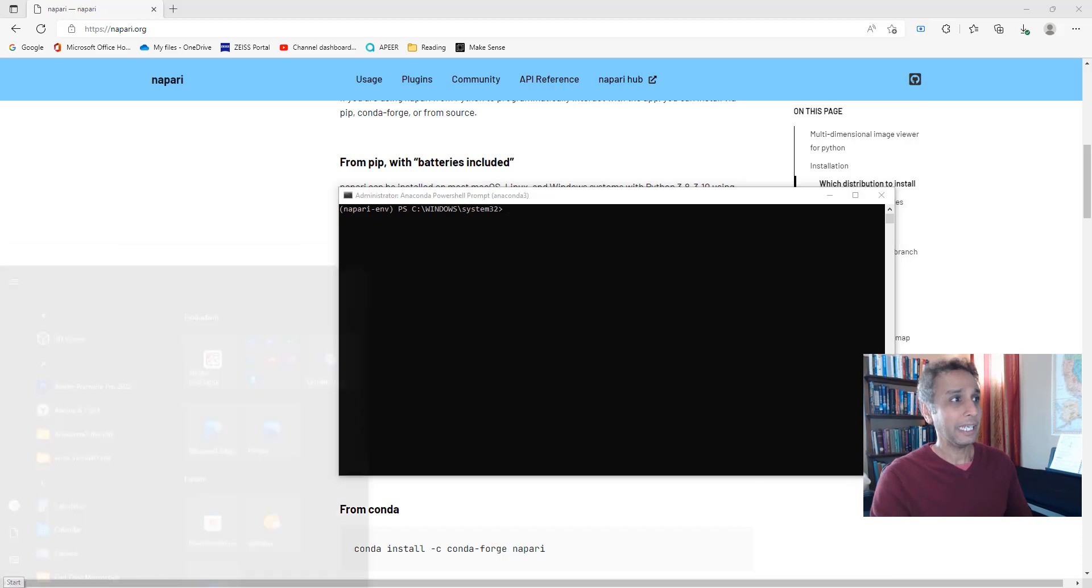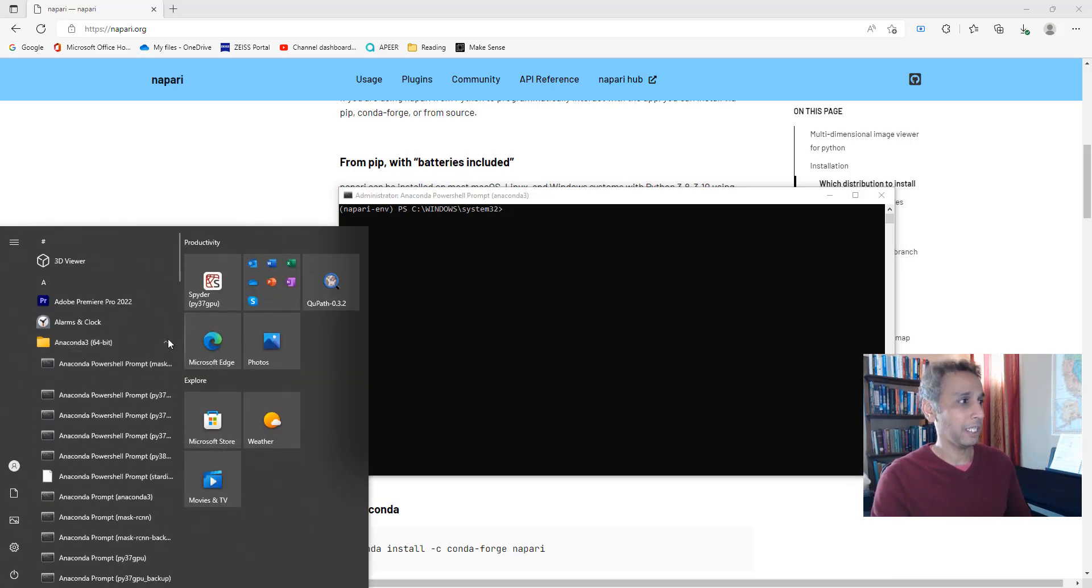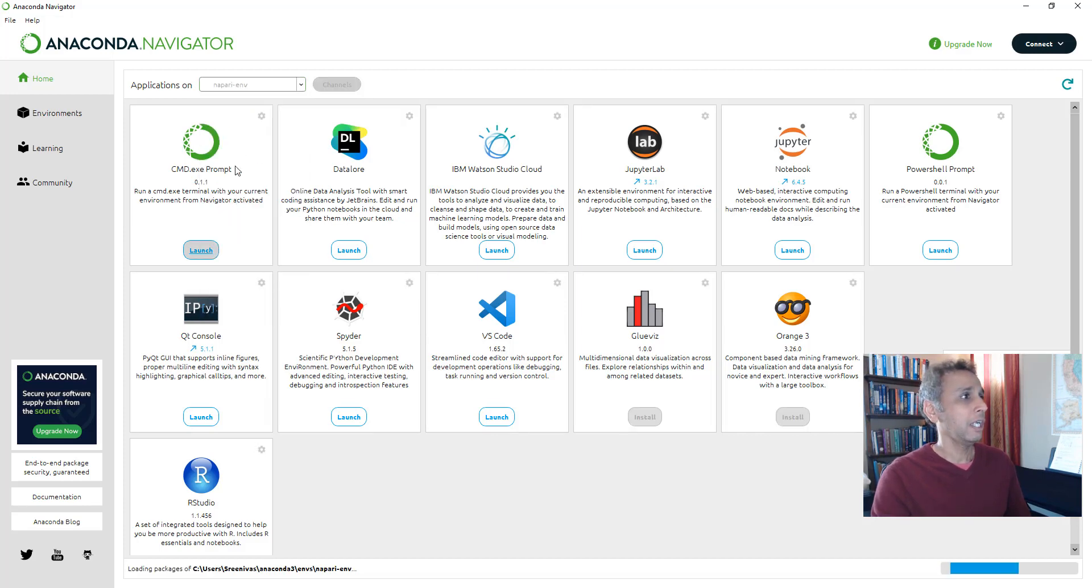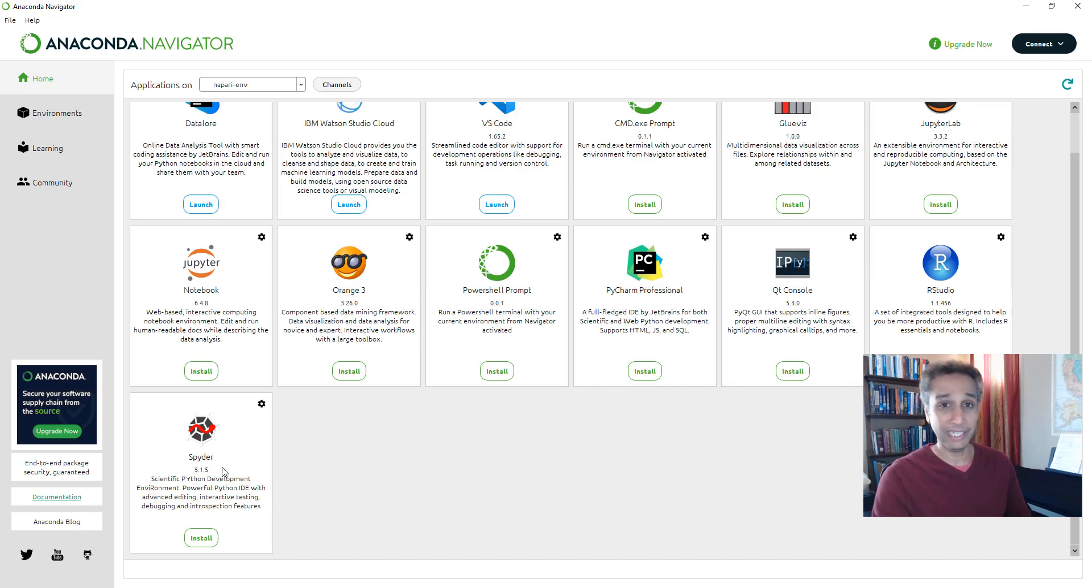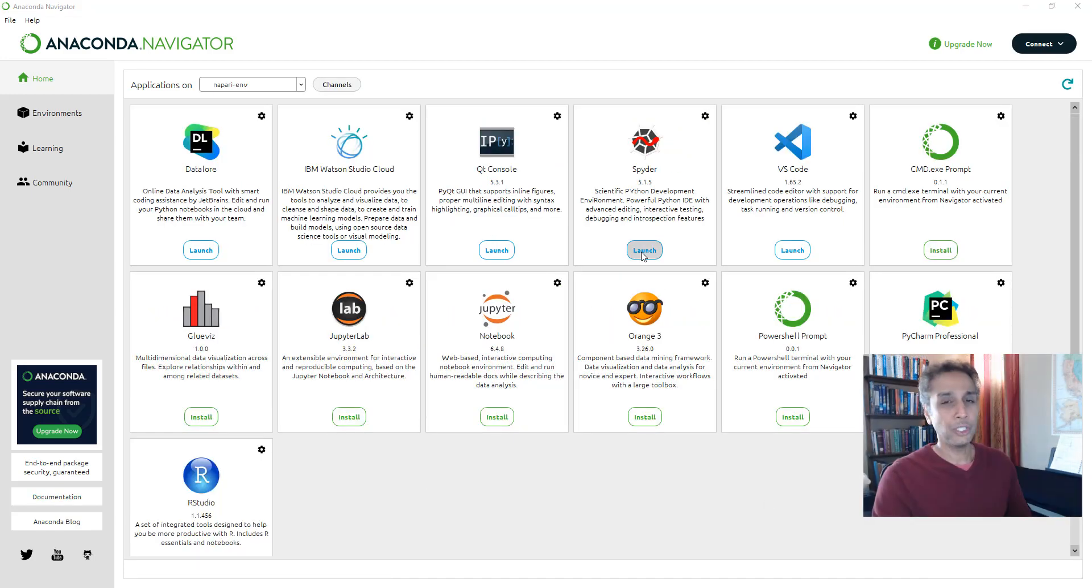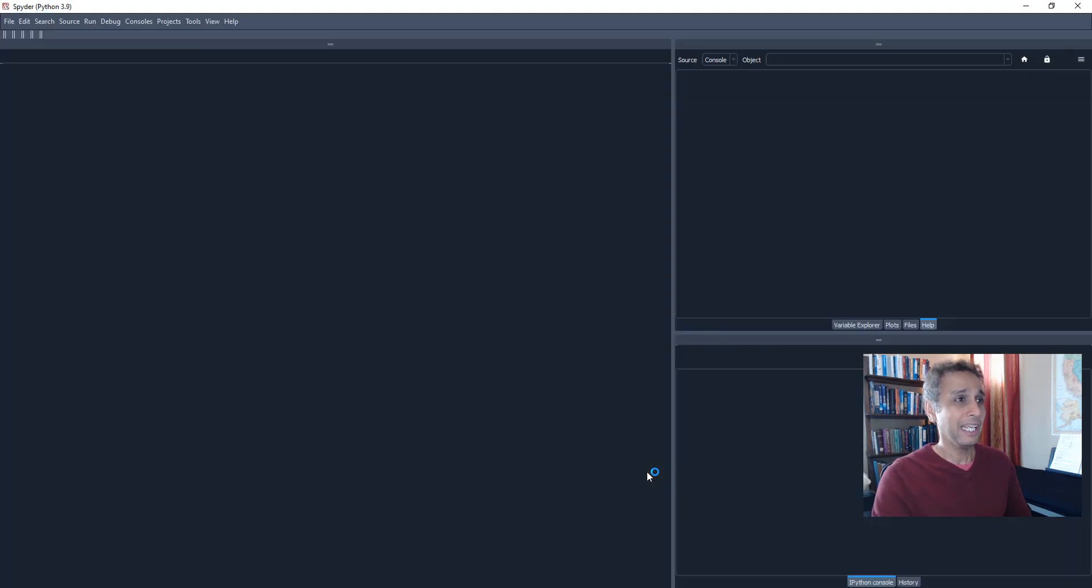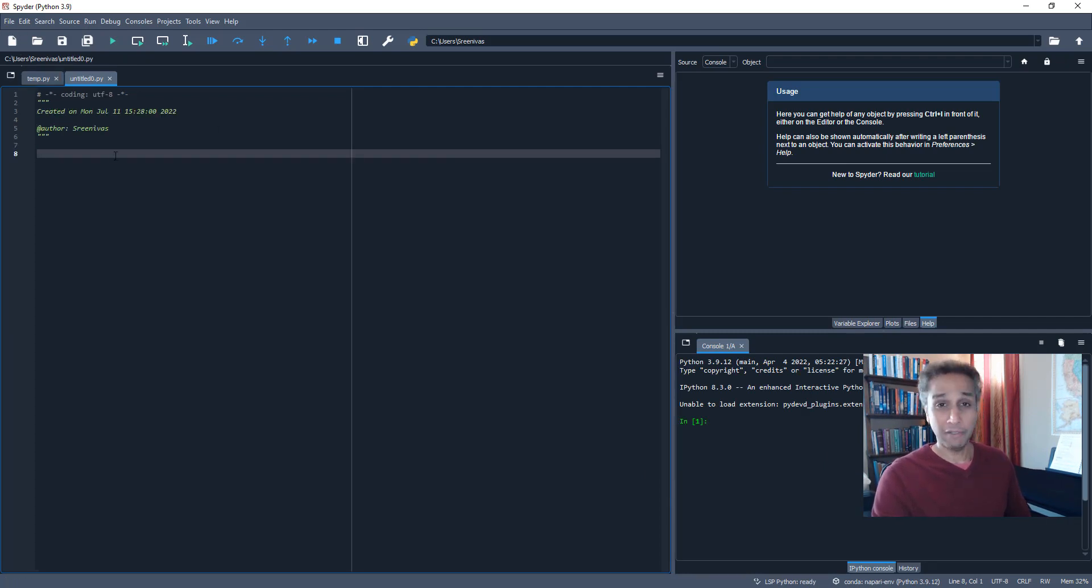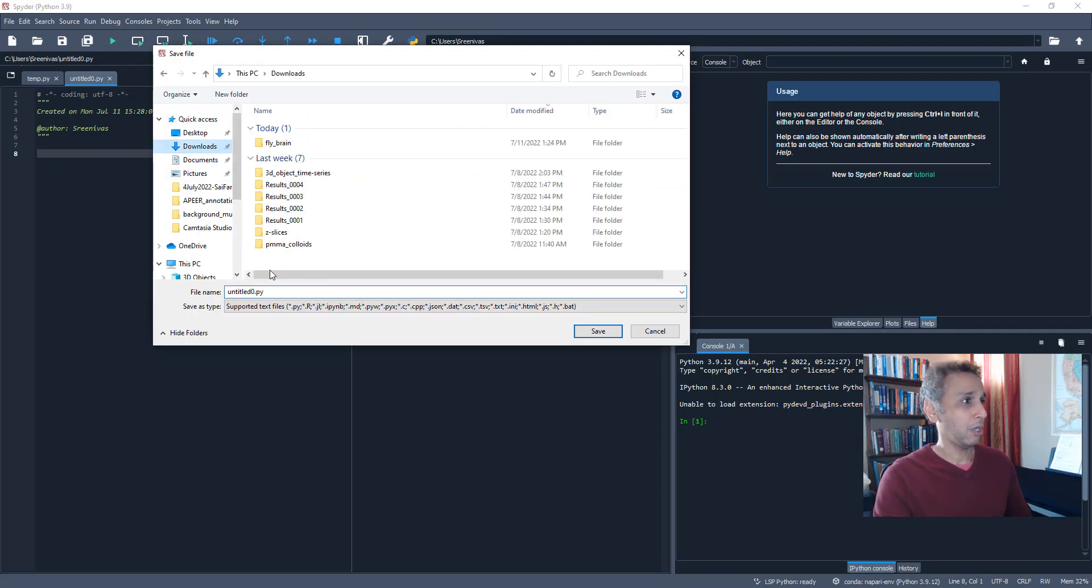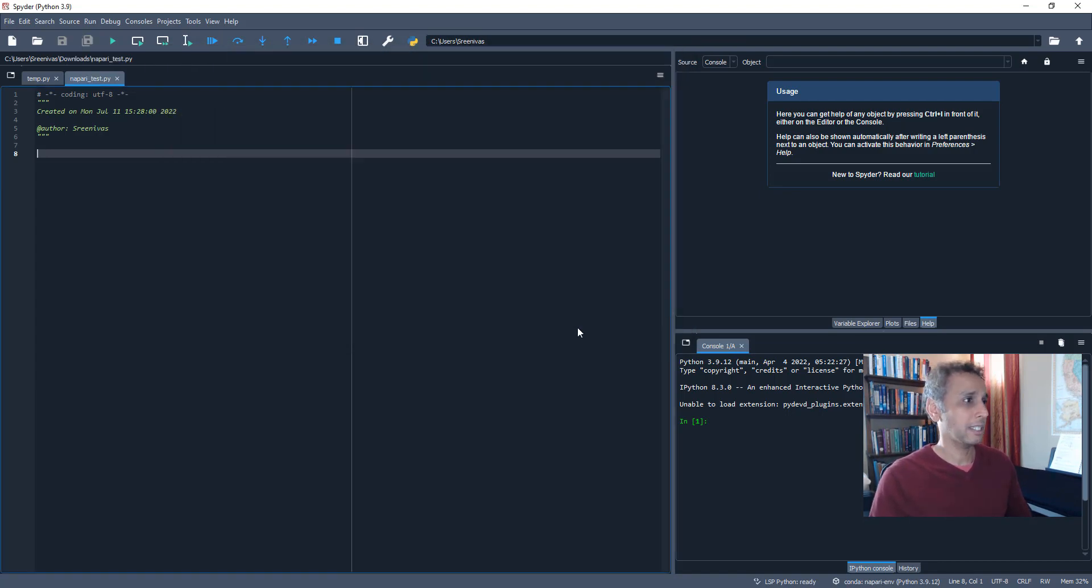So first thing first, I can run Napari from here. But I am an Anaconda Spyder person. So let's change the environment to Napari environment on my Anaconda navigator. And Spyder is not installed, so let's go ahead and install the IDE right there. Of course, you can use any other IDE, but I like to use this. So let's go ahead and launch it.